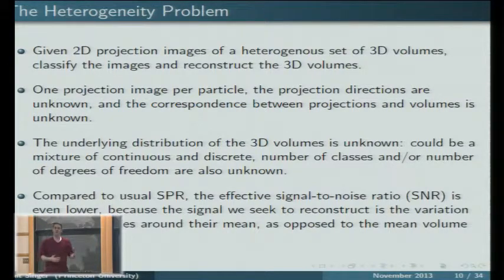And we don't even know which projection image corresponds to which volume. Usually we don't even know how many states there are. But even if I tell you there are just two states, state A and state B, you look at the projection images, and you don't know if they come from state A or state B. So there is some classification that one needs to do here, even before doing the 3D reconstruction.